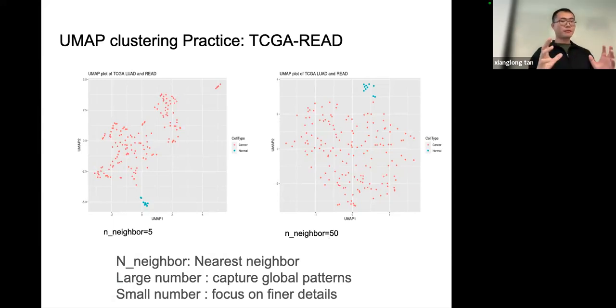I think we can think of this as using different distances to view the data, whether we enlarge it by 500 times or view it from 500 times distance away to look at the structure of the data. Both reflect the actual transcriptomic differences from each other, just by how much of the difference you want to present.